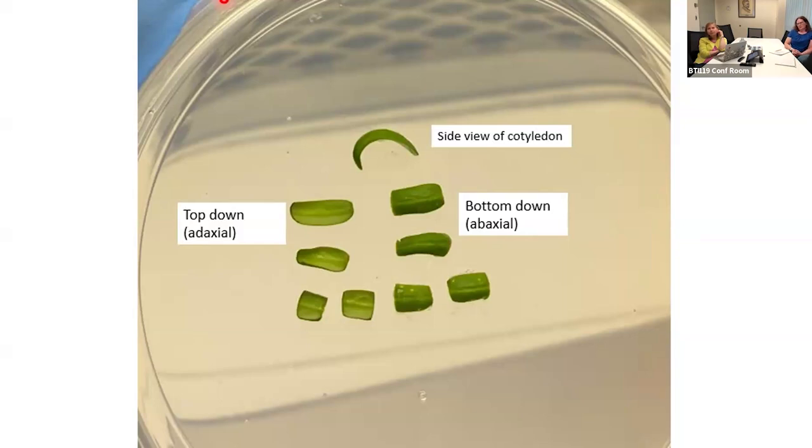Sorry, I have a question about that. That's a very good question. I know in some species people use acid during the removal of the pulp around the seed. I was wondering if you could give us some information on how to prepare seeds from fruit, please. There is that method where people use hydrochloric acid for extraction, but we use Rapidase. We soak it for an hour, I don't remember the percentage right off, and then we do a 5 to 10 minute 40% bleach soak after that, and that works wonderfully for removing the pulp.